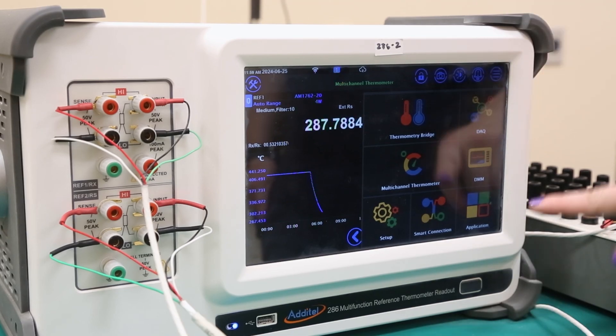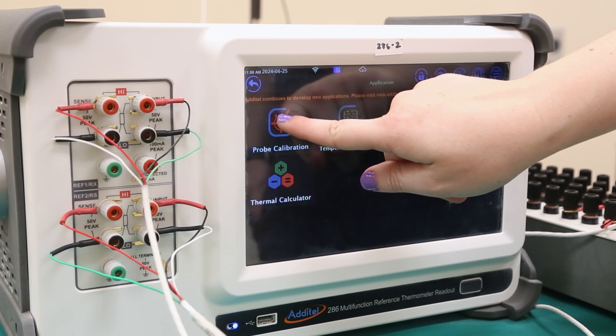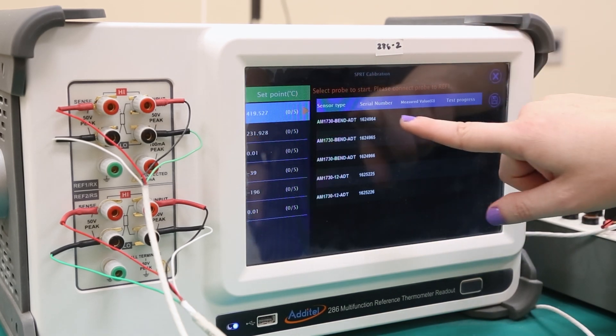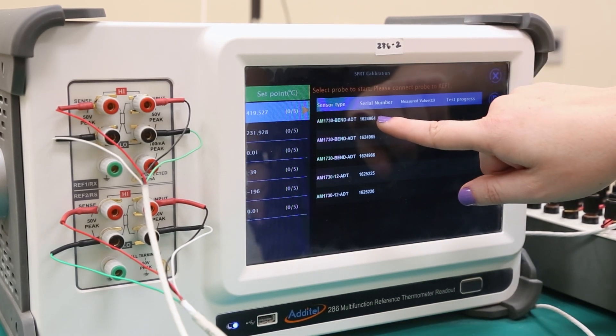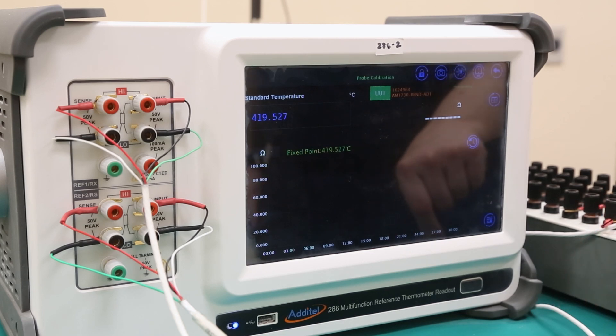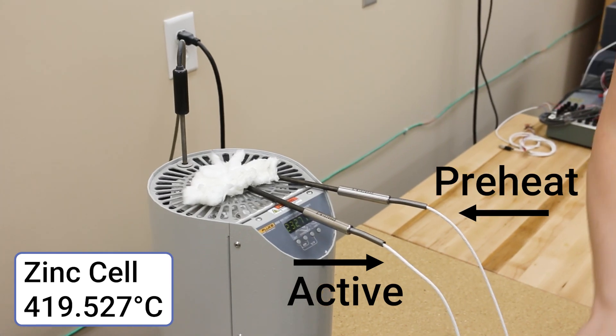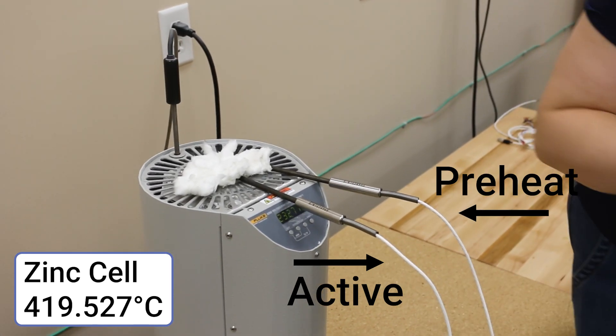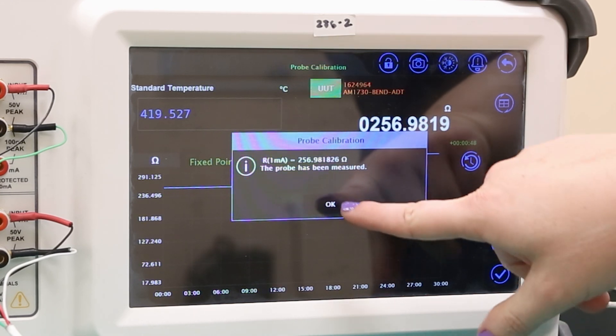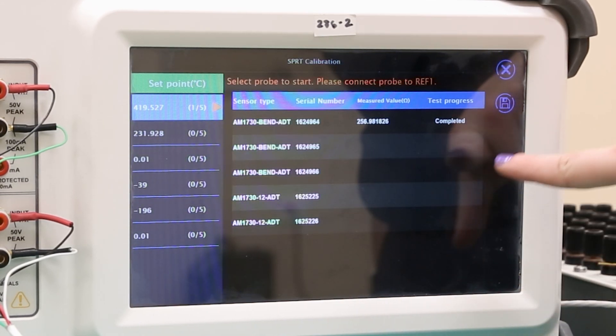On the 286, we will go back to the probe calibration application, select our test, and select the first calibration point and probe that we are measuring. After the probe measurements begin, we can set up the next probe by adding it to the preheat well of the zinc cell furnace. Once the 286 has finished measuring the first probe, press the check mark button to continue.